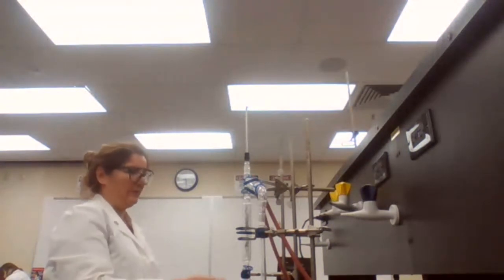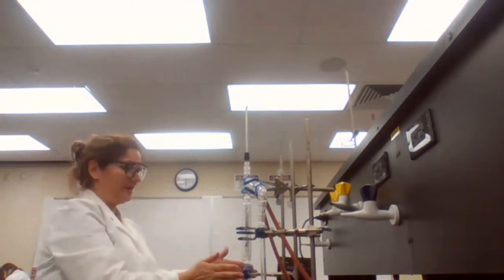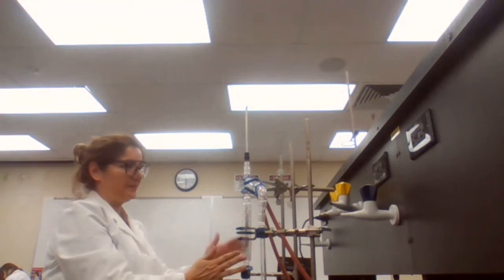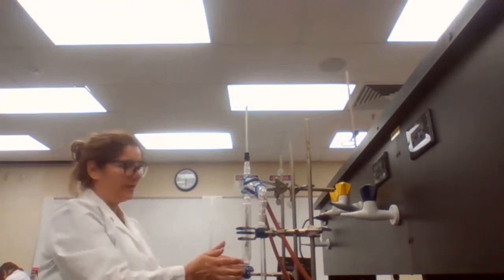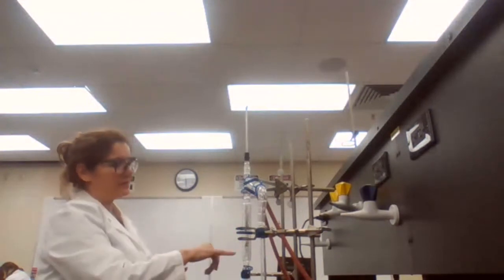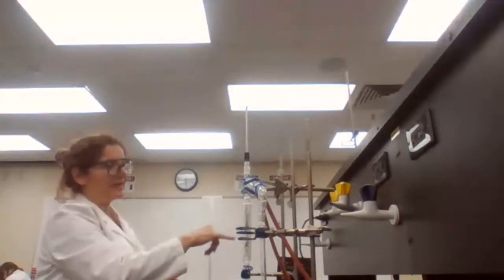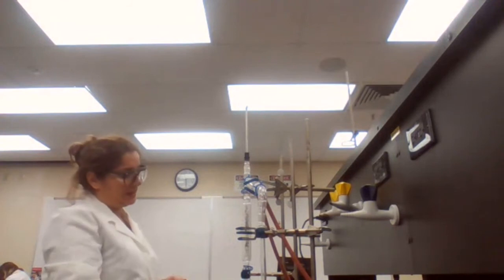If vapor doesn't reach the condenser, then we have to wrap this distillation head from this area with aluminum foil, kind of helping the process, because the fractionating column that is here is not going to let the vapor go up easily.